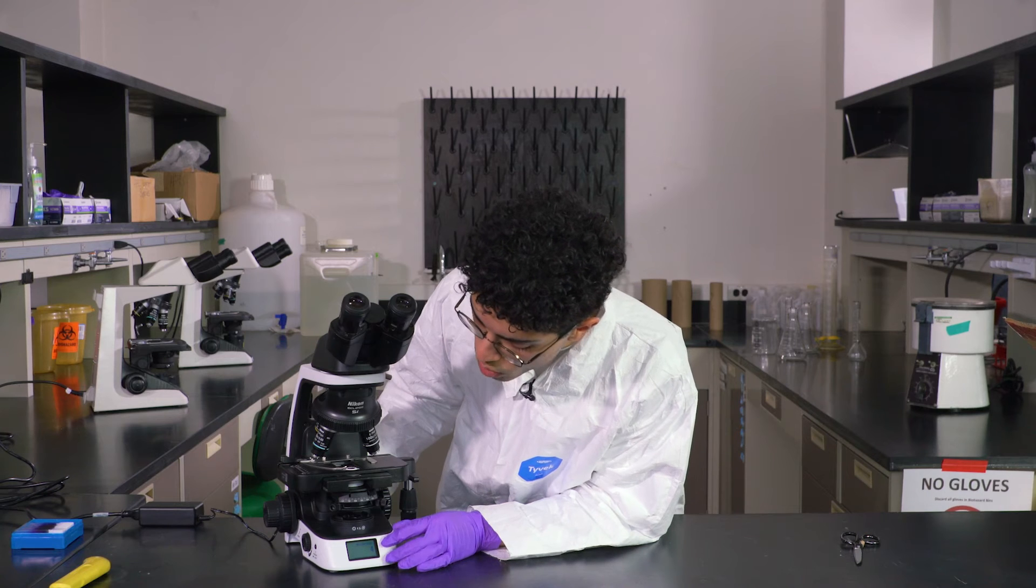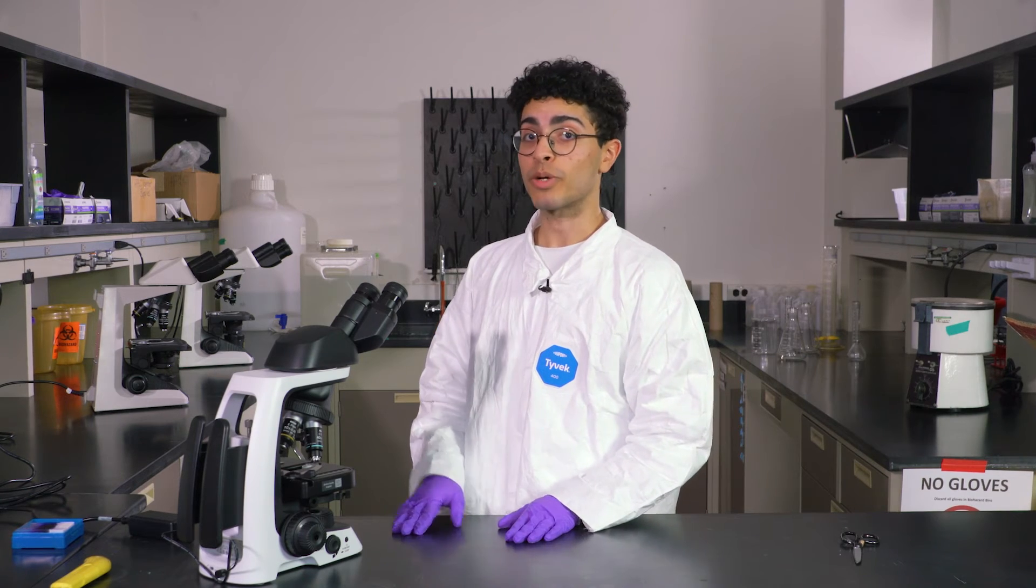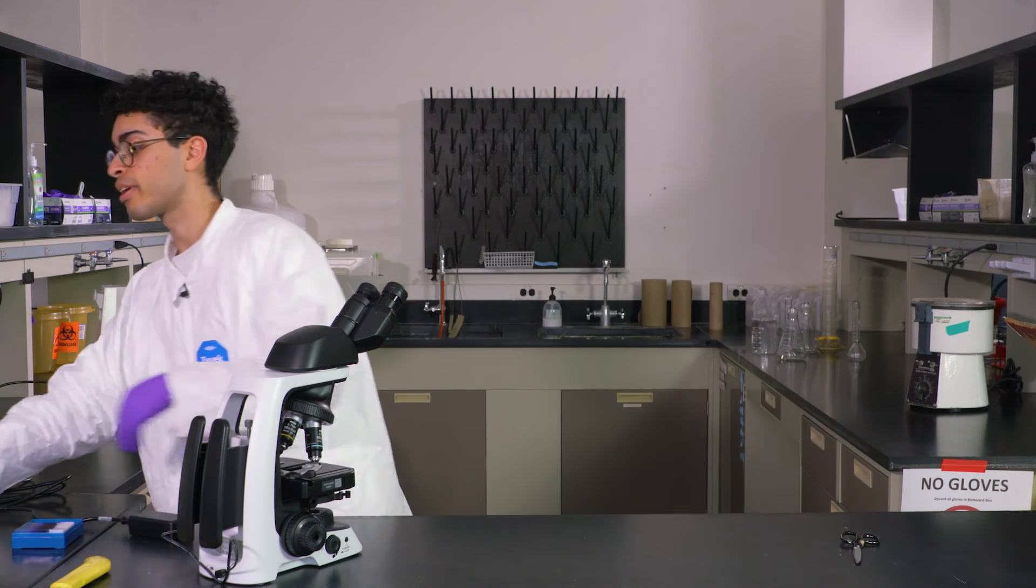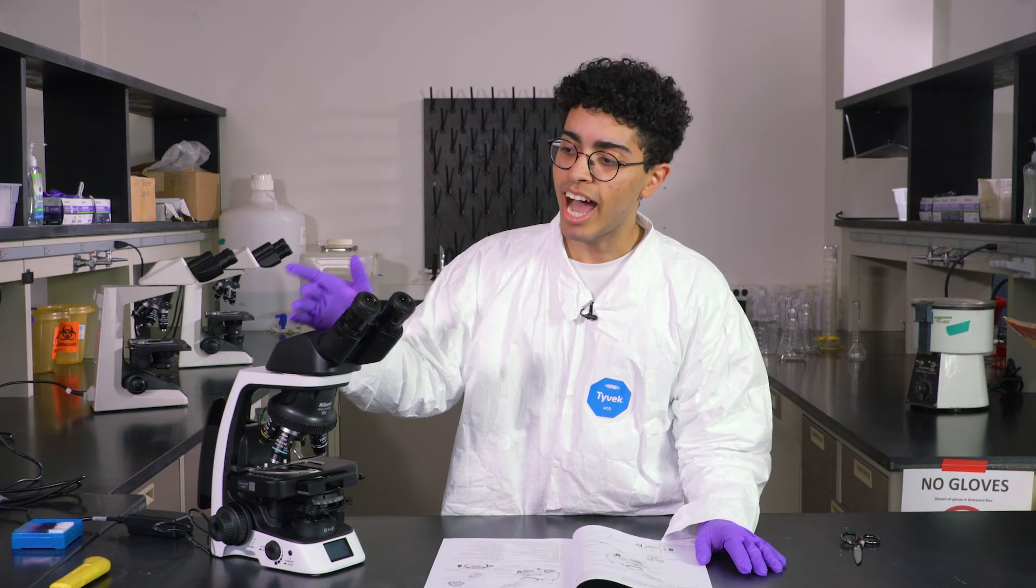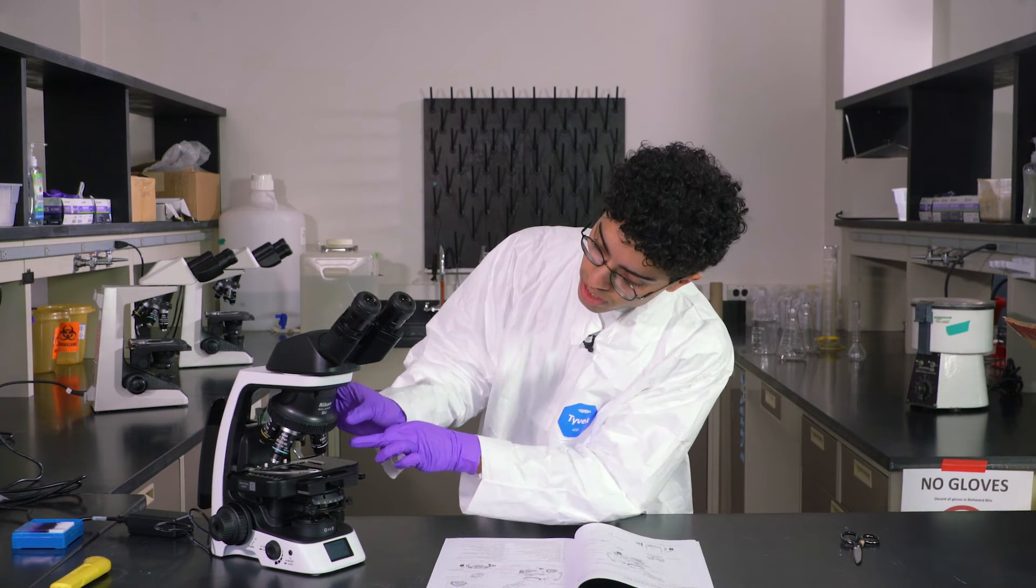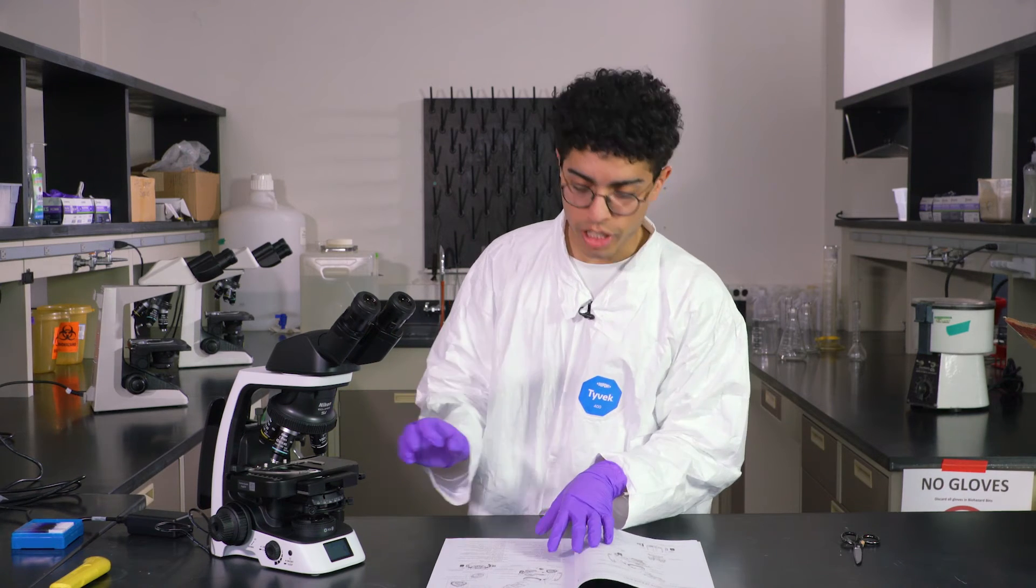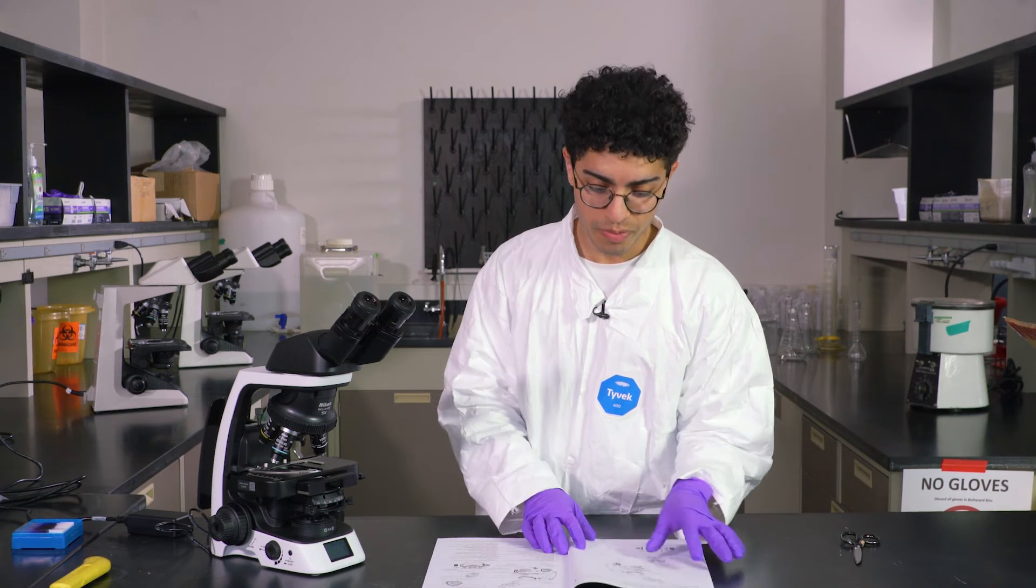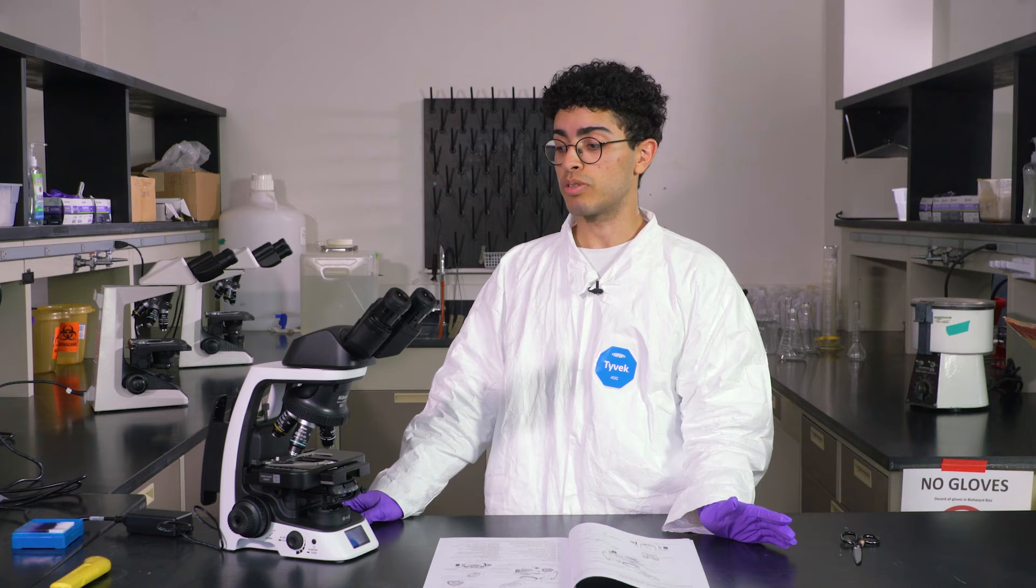Oh, it's digital on the bottom. That's cool. So now we're going to take a look at the user manual to make sure we don't break anything. So we have the eyepieces up here. The objectives are these little things here. That's what you actually look through to get the magnification. Normally you end up using most of them. At least in the classes I've taken, we use all of them.